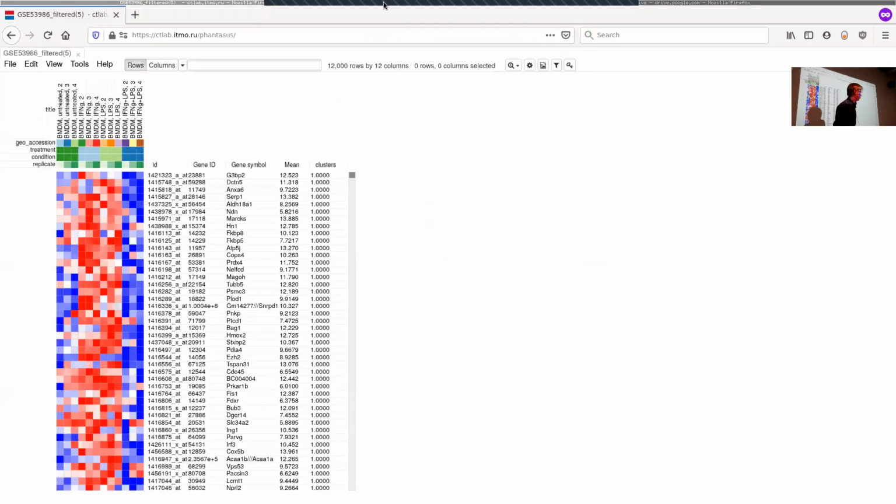So please, everyone, load the dataset, and raise your hand if you have this table. And can people on Zoom say okay, we have this, or that you don't have it? We have it. Yeah, great.